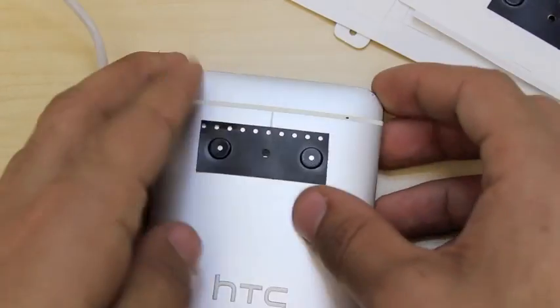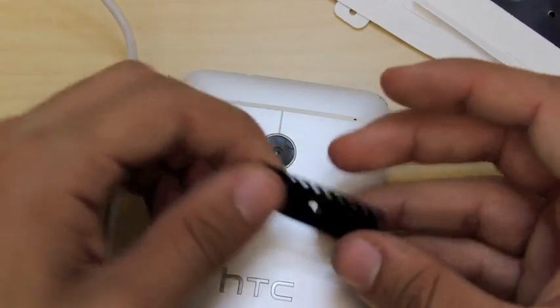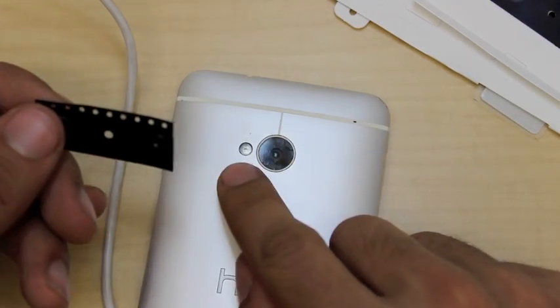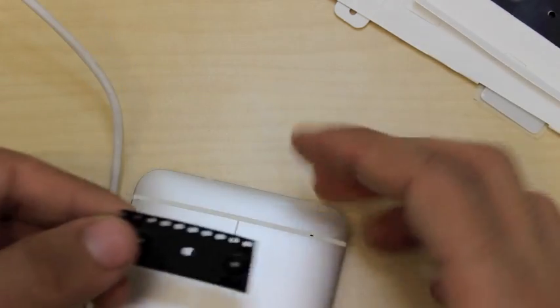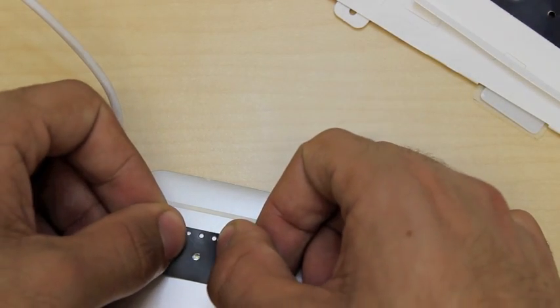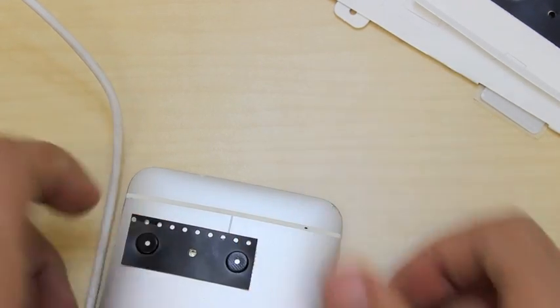Now we're going to take the strip off of the camera and move it onto the flash. You can see an LED right here, and we're going to center this hole around this LED — like that.